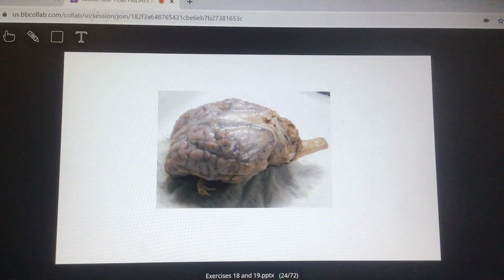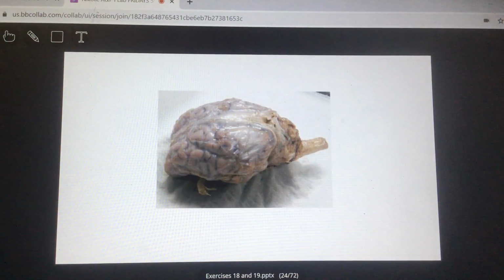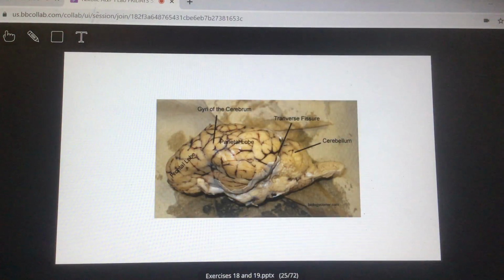Okay. All right. This is just another image with the dura mater. Now, here they can ask for the lobe. So usually we're going to see that in an image where we've removed that dura mater, right? You can't really make out much with the dura mater on the brain. You really have to remove that dura mater. So that's dura mater, which is very obvious. The kind of shiny stuff you see would be the pia mater. You can't actually see it, and if you try to take it off, it just comes off in almost little flakes, right?